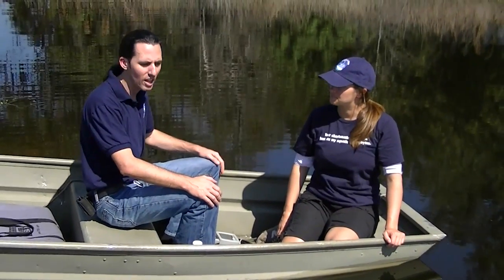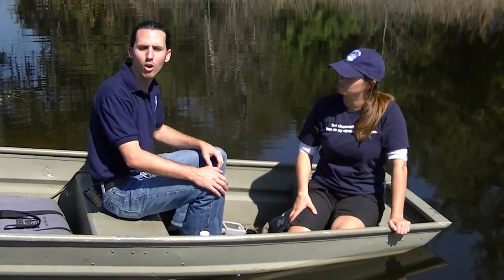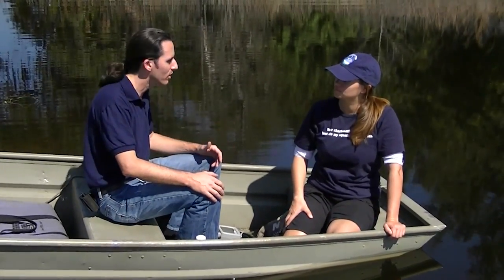Alright, so we're out on a lake with April. She's a sampling volunteer for us, just like you, that helps us sample lakes, streams, and ponds. And we're going to show you some of the techniques that we use to take samples, and also some of the things that you do as a volunteer.